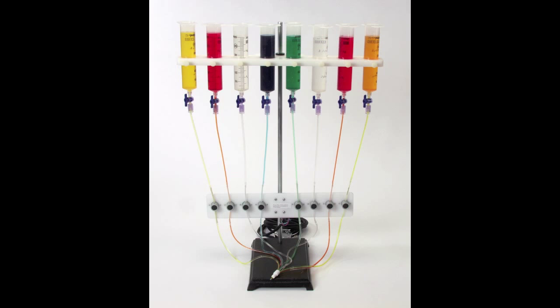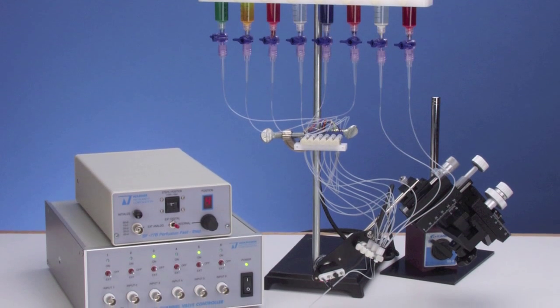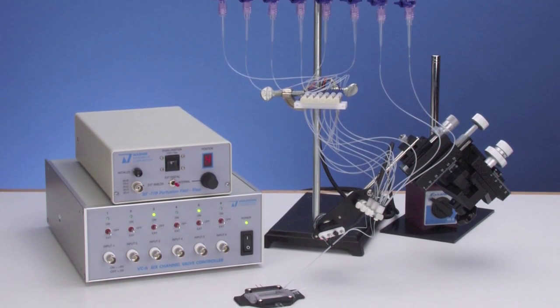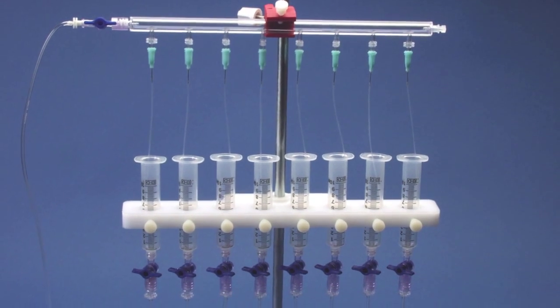Warner Instruments valve control systems are an ideal tool for multi-drug delivery using a gravity-fed perfusion paradigm. Gravity-fed perfusion is preferred because the pulse-free nature of the flow minimizes mechanical perturbations within the chamber.